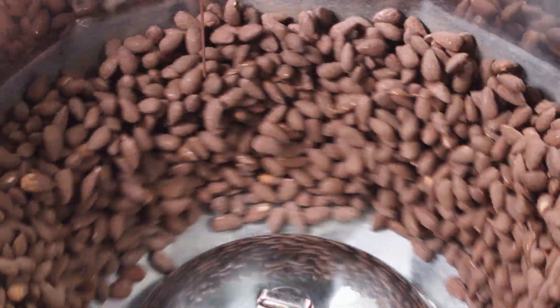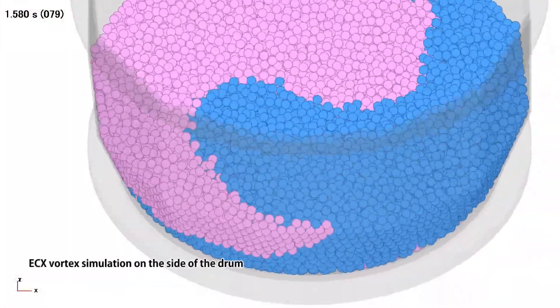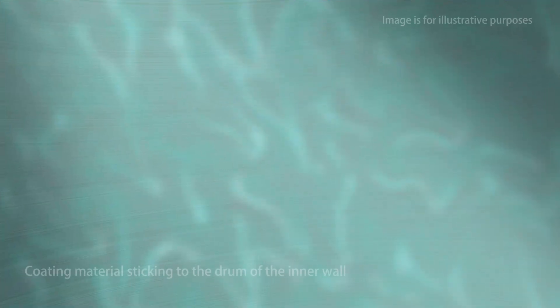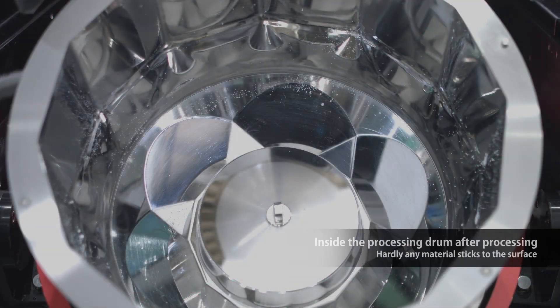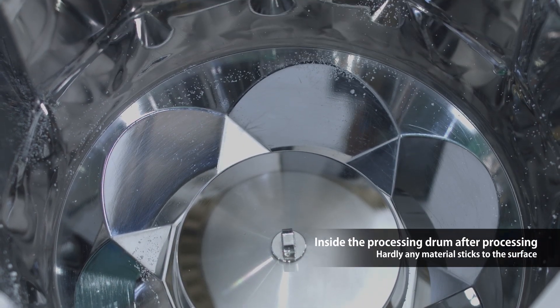Another advantage of ECX is its ability to reduce material waste. With unique vortex flow, each particle moves without stopping. If the amount of input is systematically maintained with an automatic feeding device, the pieces are stirred and centrifugally pushed against the drum wall, from which excessive coating material is rubbed off. This enables ECX to curb waste by reducing adhesion of coating material to the inner walls, which was not possible with previous machines.